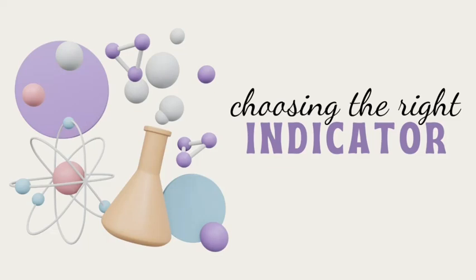In this module, we're going to look at how to choose the right indicator and how do we help our students understand why we use certain indicators and what they're actually representing and what they're telling us.